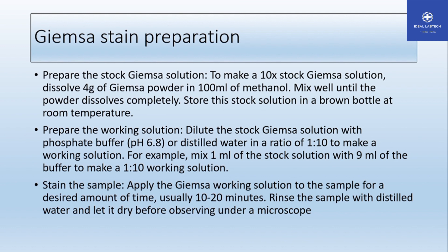This is the stock Giemsa solution. Now prepare the working solution. To prepare the working solution, dilute the stock Giemsa solution with phosphate buffer at pH 6.8.